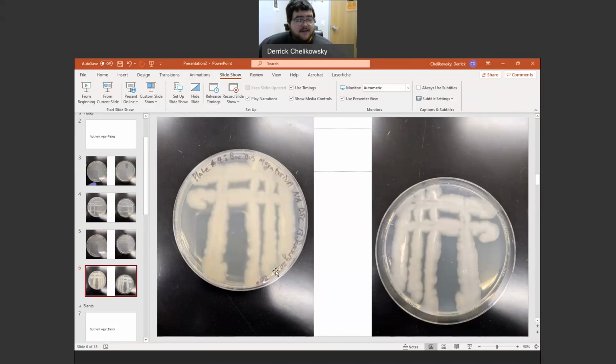And this is Bacillus megaterium, and as you can see, Bacillus tends to take over a plate. This was not after 24 hours. This was after 18. So after 18 hours, it just takes over everything. On your lab guides and worksheets, fill in the table as best as you can using the guides inside your lab manual.